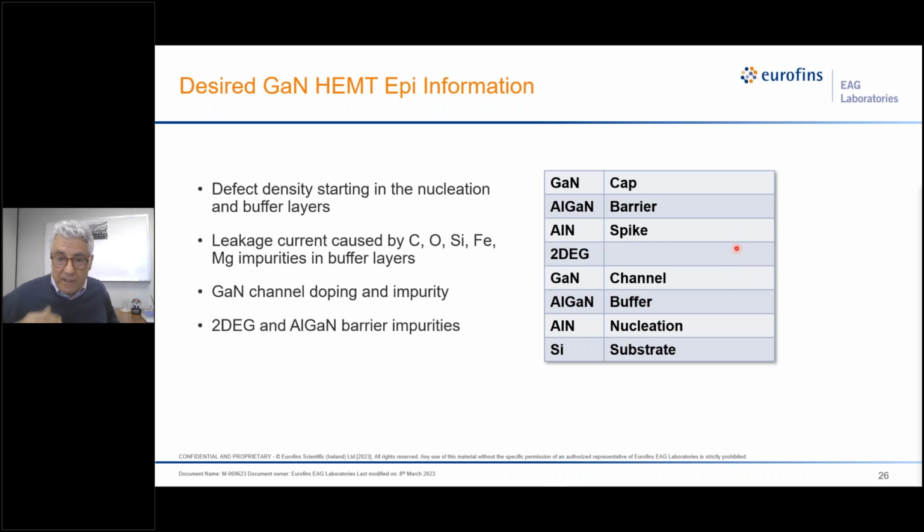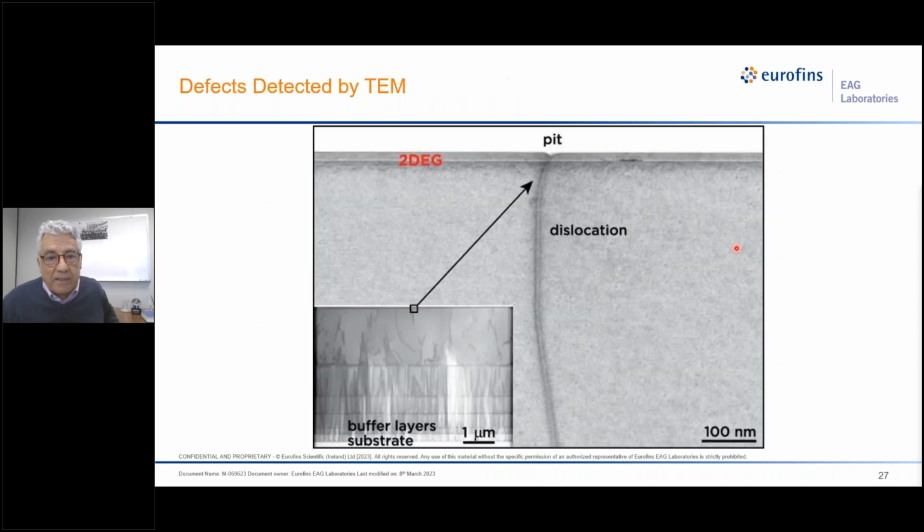And the challenge, even in the SIMS analysis, is that these layers have these dislocations and defects all throughout the epistructure. And even though these layers are grown to minimize the defects right where the transistor action is happening, some of them make it all the way to the top. This is the surface here, this is your 2DEG region, and these dislocations can make it all the way to the top. Well, I'll show you examples of how they affect our SIMS measurement.